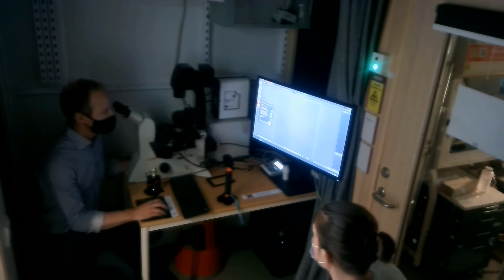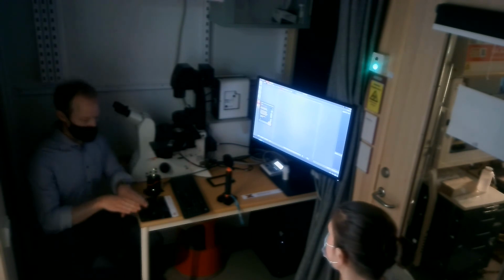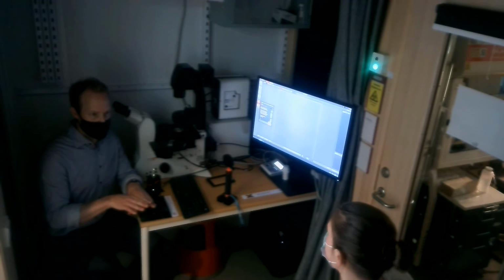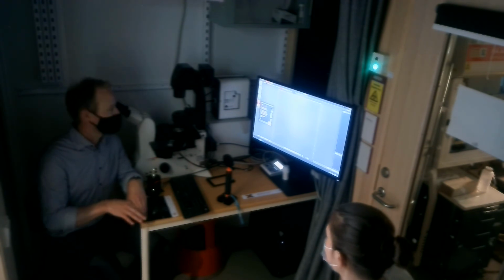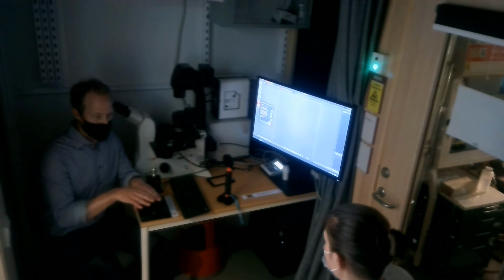What exactly is that? So, in statistical, what you can get sometimes with smooth is that in the overlap, when they stitch, it can be a bit smudged for some samples. In those cases, statistical could give you a better result. The algorithm behind it, I'm not really sure. And none, I think, will match it, but there won't be any sort of transition going on.